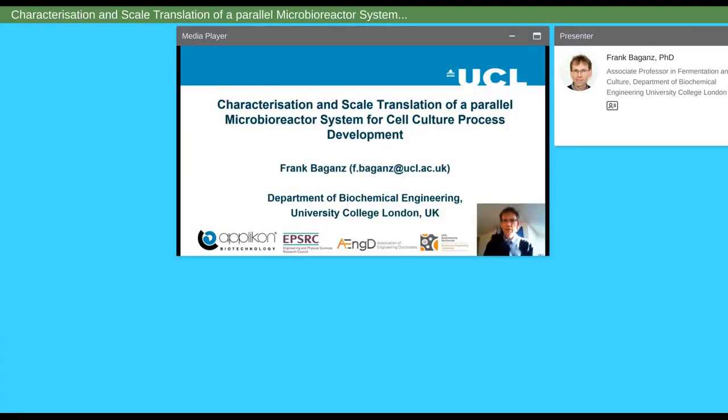Hello, my name is Frank Baganz and the title of my talk is Characterization and Scale Translation of a Parallel Microbioreactor System for Cell Culture Process Development. This work is part of an engineering doctorate project between UCL Biochemical Engineering and Applikon Biotechnology. The aim of the project is to establish the micro-Matrix as a screening tool and scale-down model for cell culture applications.